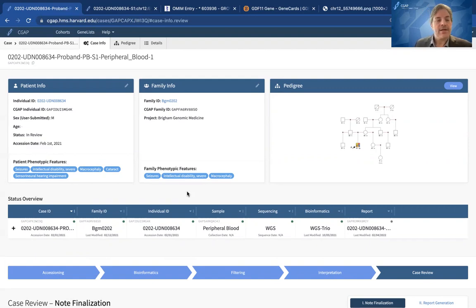And in that case, you can go back, for example, to the filtration and create other filters to broaden your net, for example, broaden your search based on a gene, or perhaps broadening filters to look at non-coding variants like UTRs or other variants that may have been missed by that very restrictive first pass that I utilized.